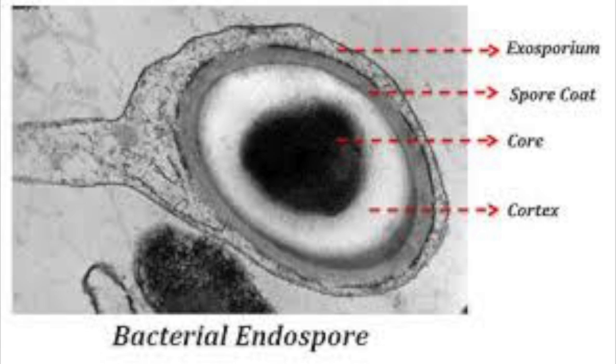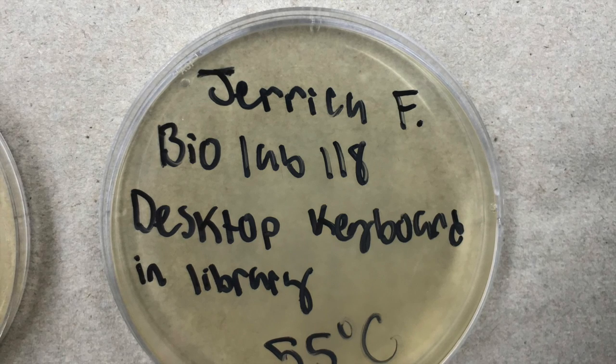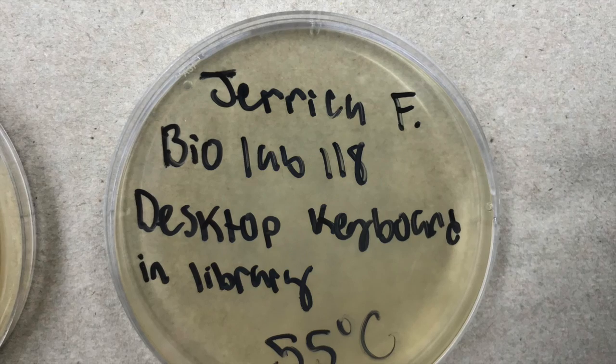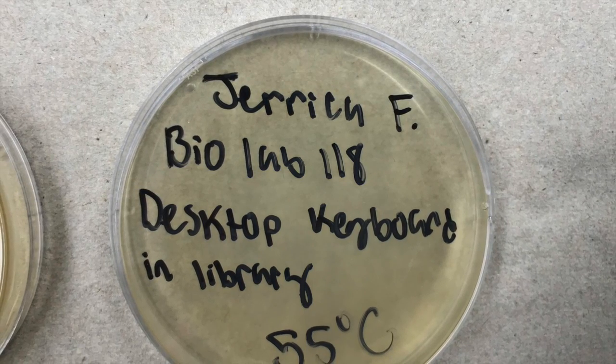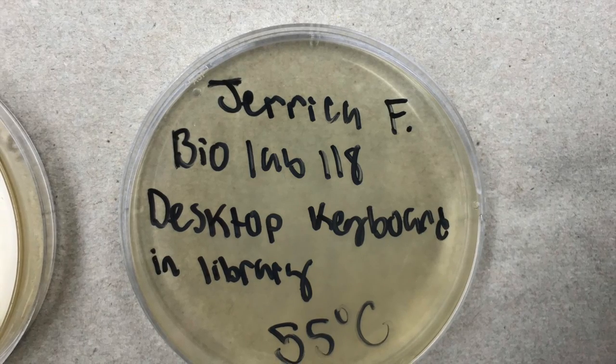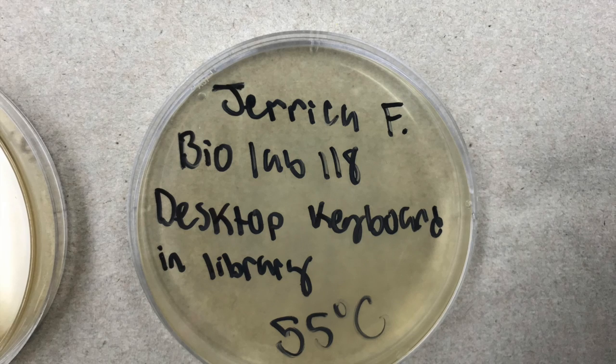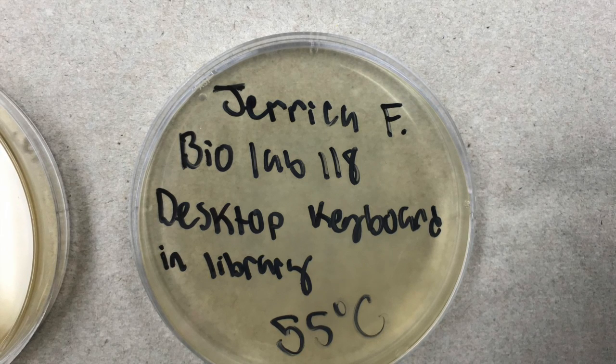One of the major protectants of the bacteria in a harsh environment such as heat and cold temperatures is called an endospore. For one of my agar plates, I placed it in 55 degrees Celsius and all the bacteria died in it. So that told me that the bacteria on the desktop computer did not have any protective layers that can protect it from heat.